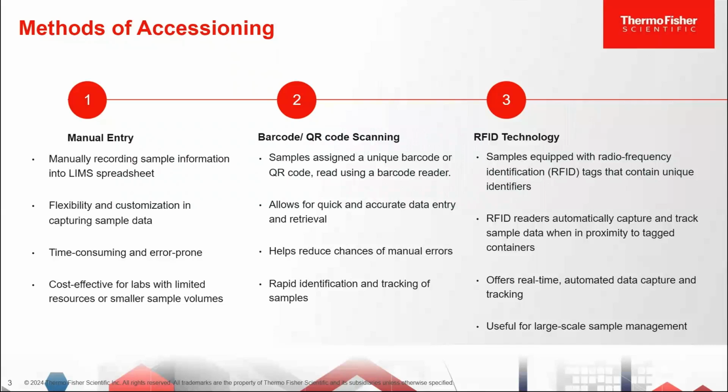So this allows for flexibility, customization. You can capture all kinds of sample data according to your specific lab requirements. However, manual entry can be time-consuming and prone to human errors. It serves as a cost-effective option, though, for labs that may have limited resources or smaller sample volumes.